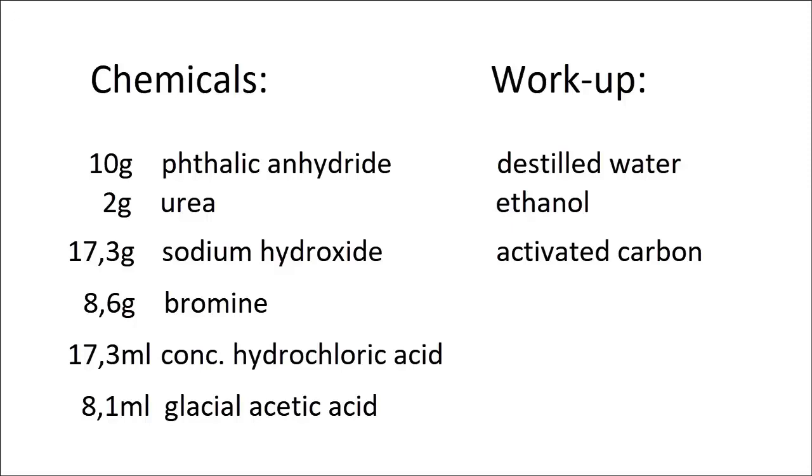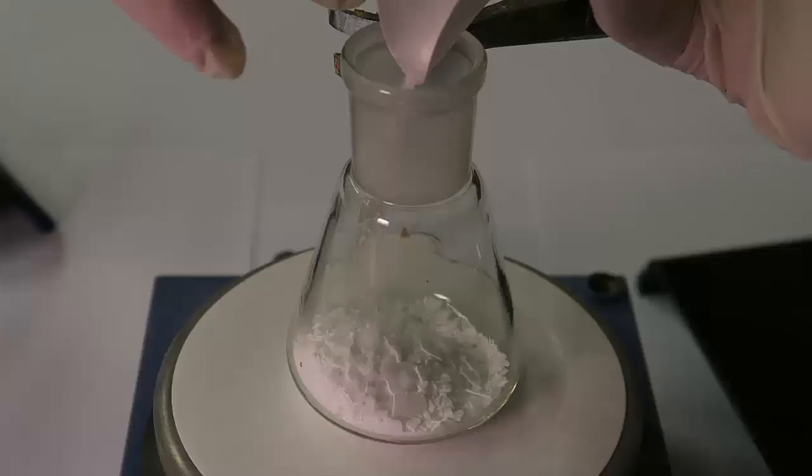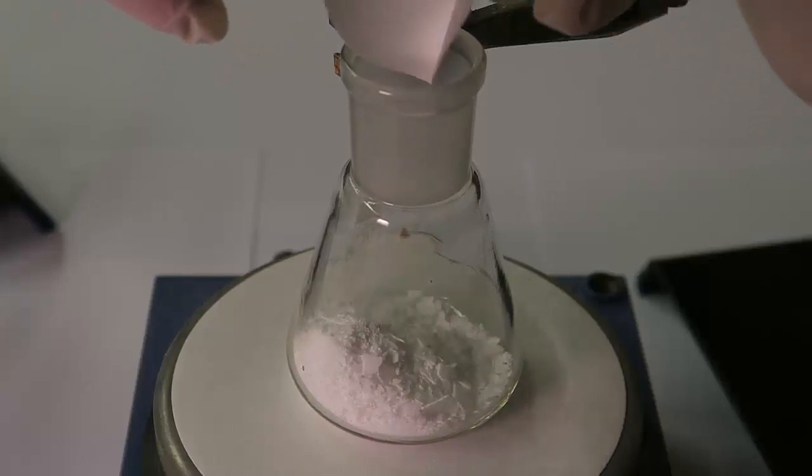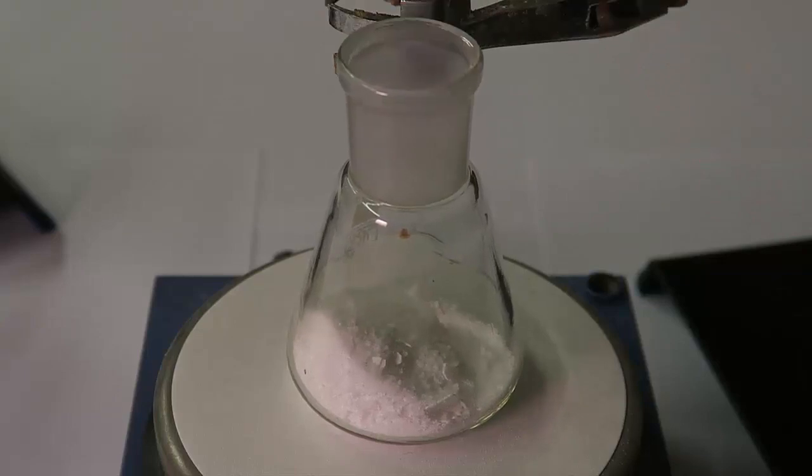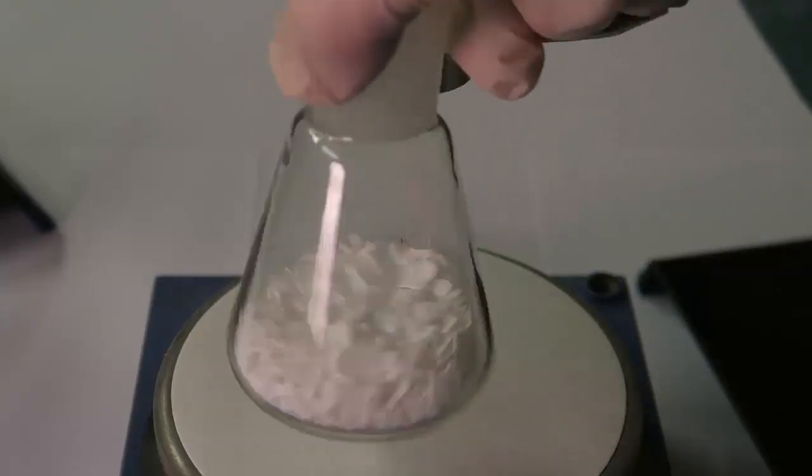Considering the workup, a bunch of ethanol, water as well as activated carbon should be available. 10 grams of phthalic anhydride are added to an Erlenmeyer flask followed by 2 grams of urea. The flask is then shaken to mix up the chemicals as much as possible.